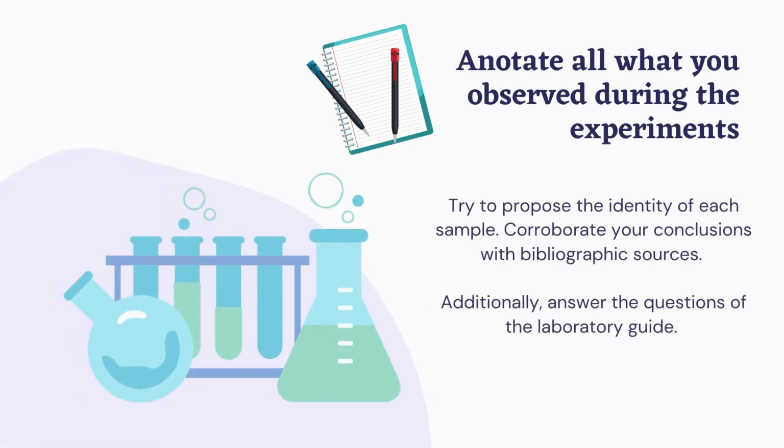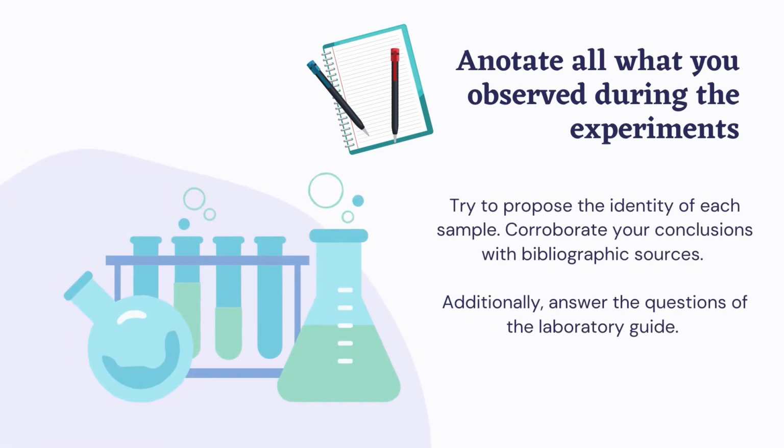After annotating all that you've observed during the experiments, try to propose the identity of each sample. Corroborate your conclusions with bibliographic sources. Additionally, answer the questions present in the laboratory guide.